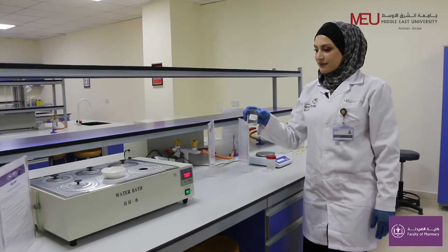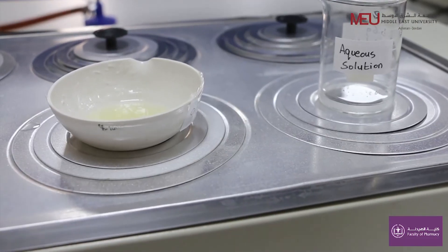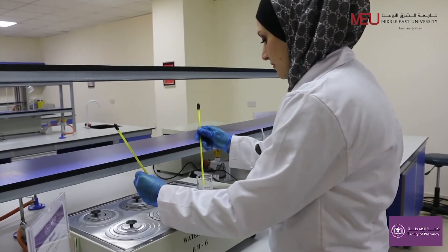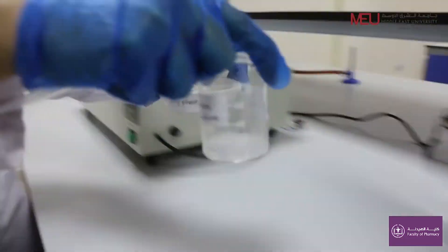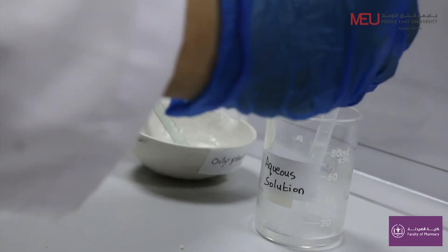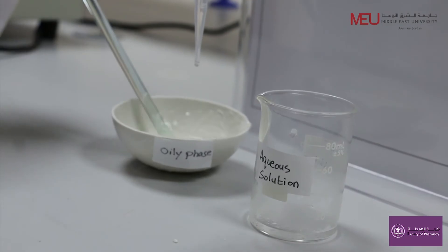Heat the aqueous solution also using a water bath at 70°C. When both the oily phase and the aqueous phase are at 70°C, gradually add the aqueous phase into the oily phase drop by drop with continuous stirring.